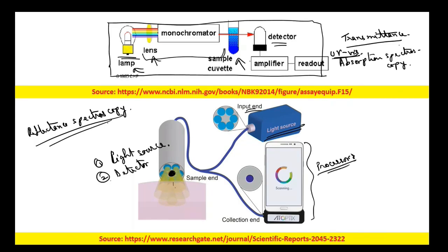Now you have to remember the basic architecture of the absorption spectrophotometer and the reflectance spectrophotometer, because as we go further into more spectroscopic methods, the main change will be the lamp position. The optics will also change, because some optics are opaque in certain regions.